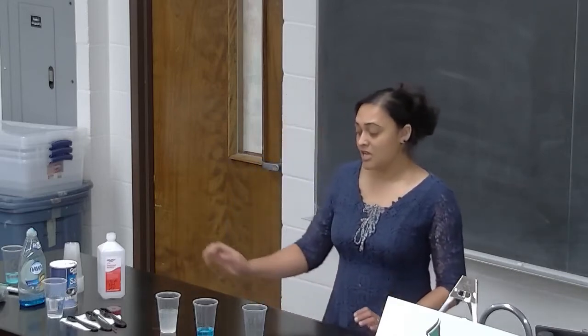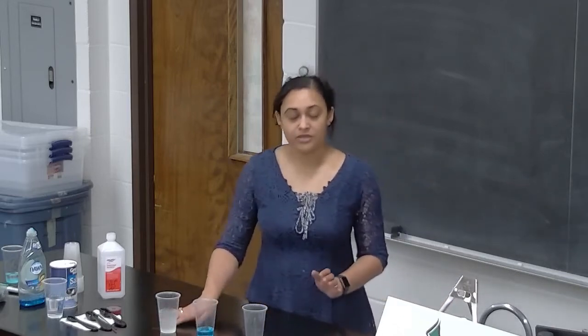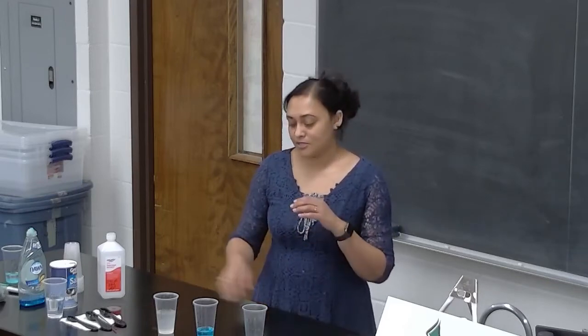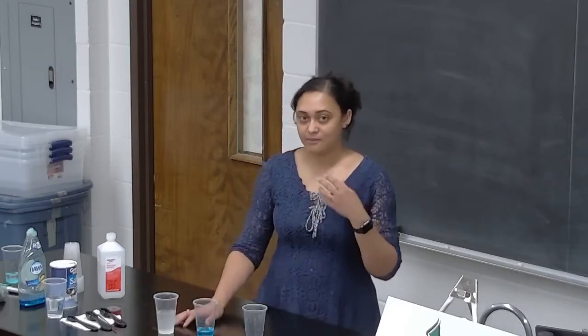So why are we using salt water? What salt does is it helps loosen. We will take the salt water inside our mouth and spit it out. What salt is doing there is helping loosen our cells inside our mouth, and it also helps in getting water out of the cells so that the cells can stick together.